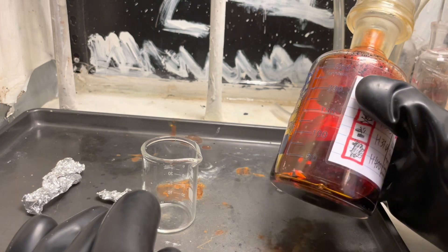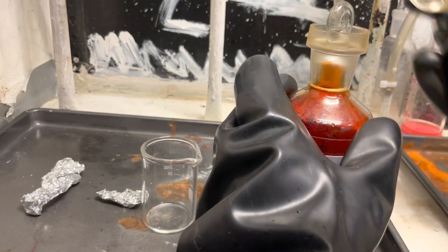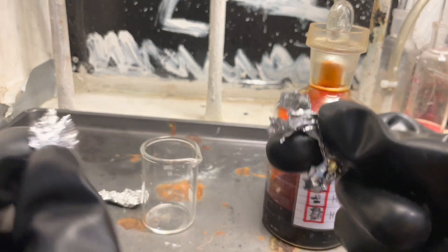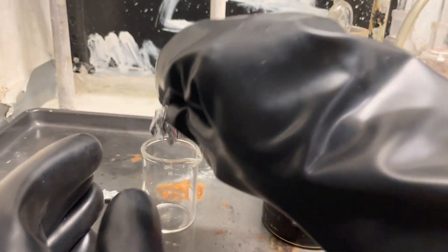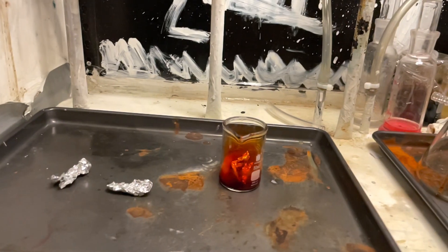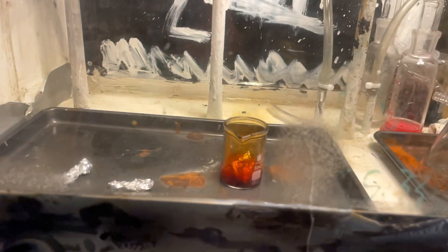Now let's do a classic fun experiment. You take your bromine and some aluminum foil, stuff the aluminum foil into a beaker, take out some bromine, add it to the aluminum foil, and wait.